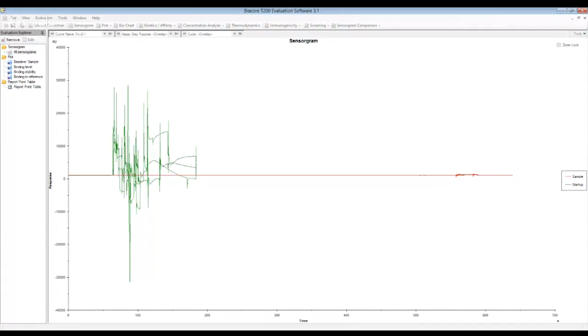And then here you say remove selection. It removes it. Sometimes you get some spikes in the middle of your data, and you might want to remove them. So you can again right click and say remove, and it removes it. But right now I don't want to, so I'm going to just keep the data as is.